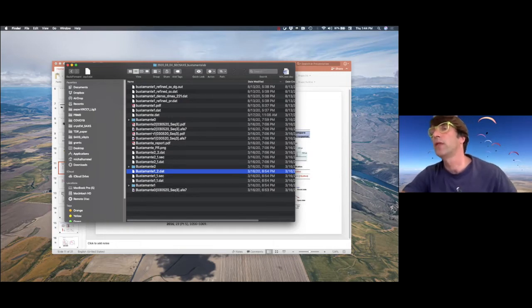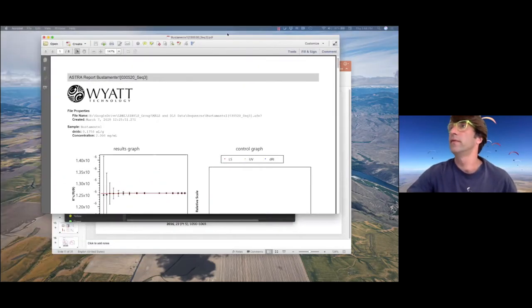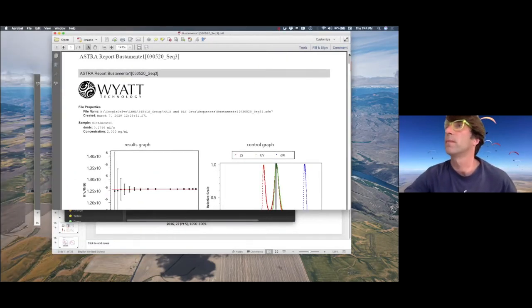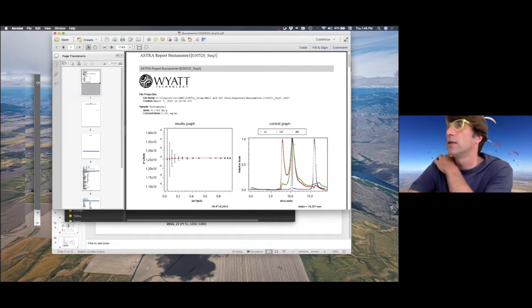And that's, again, huge thanks to Daniel. He found a fast way to take the software that we use to analyze MALS data. So when you look at what you receive here, my computer gets very, very slow when I open this for some reason. Let's say sample 1, and that's just some aggregation. You can see it in the light scattering signal, the red line, and then you have a separation of the main peak into 2 peaks. And then you have some small molecules floating outside.